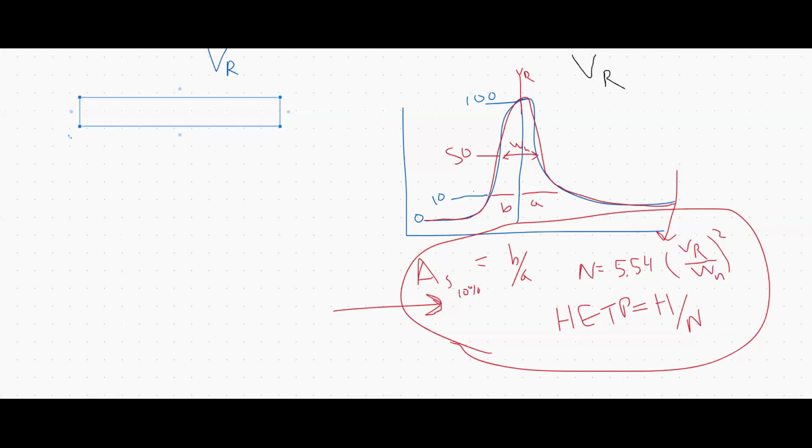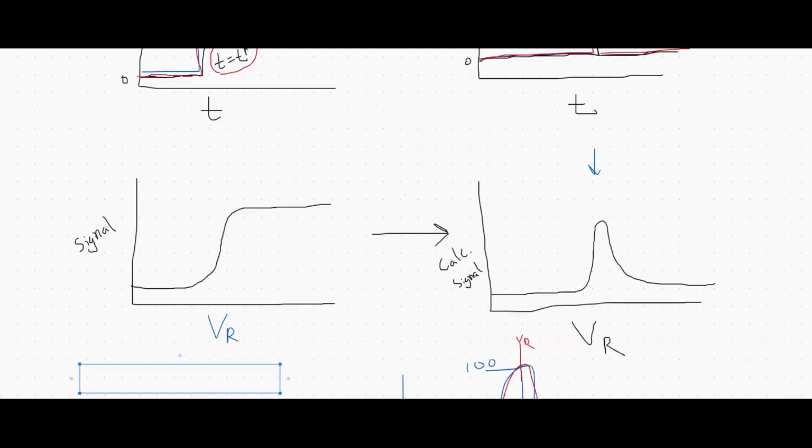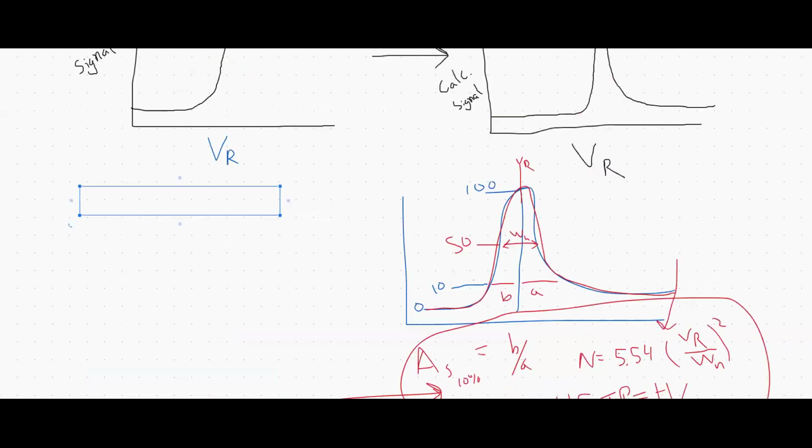The other thing that you may use this for is, you'll notice, I'll go up here, you see this in your chromatogram potentially as you're changing phases. So there's no need for a dedicated qualification.